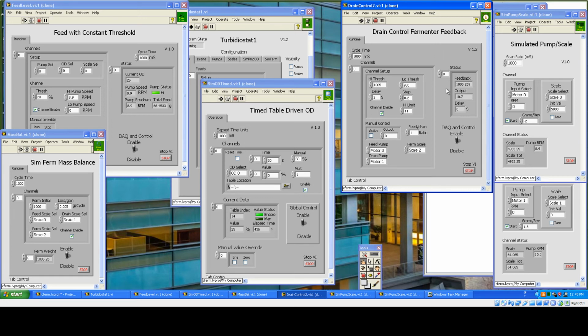And this does create sort of a long-term oscillation, but it's a small oscillation, and we're dealing with rather large volumes. The idea here is it's not really critical to try to keep this within an incredibly small range. So eventually what's going to happen is we'll run off the end of the table. Index 18 is the last index. And now we're basically oscillating around the high threshold, keeping this thing regulated.